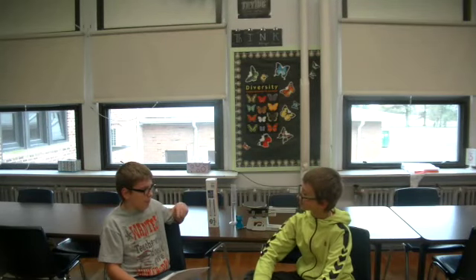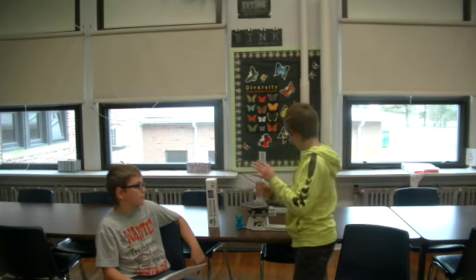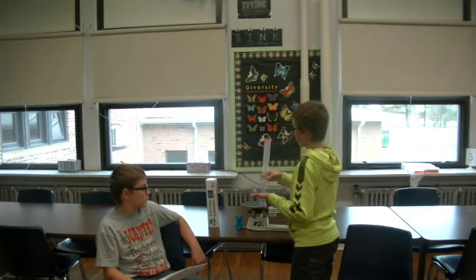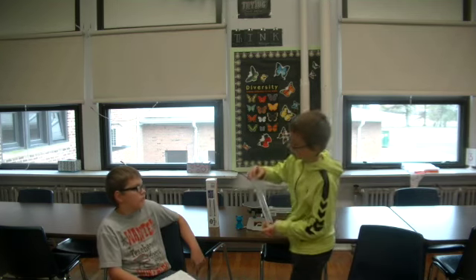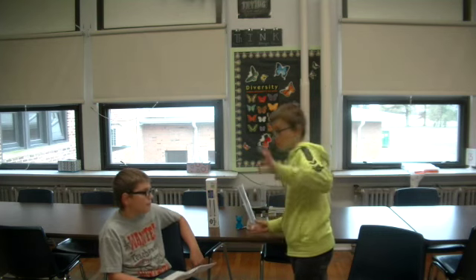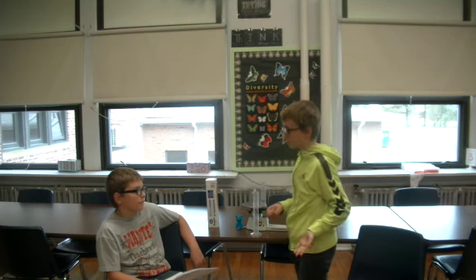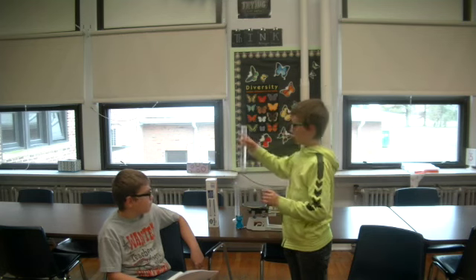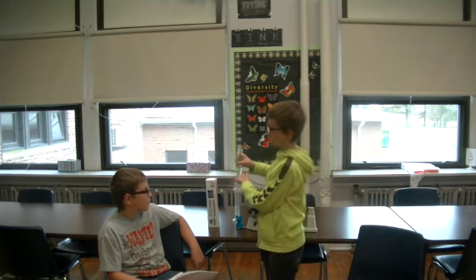Okay, what's the displacement method? Well, the displacement method is when you, for example, put water in a graduated cylinder, and then you put whatever you're trying to find the volume of in it. I would suggest using an irregularly shaped object, like this marble here. The marble is a sphere, which we could find by using circumference and stuff, but that's not the easiest way. We would put it in very carefully, and then we would measure the new level.